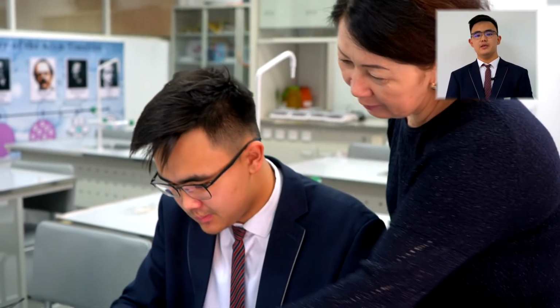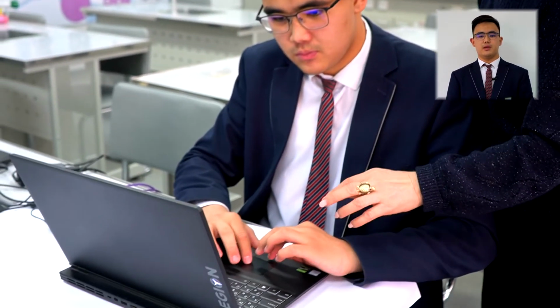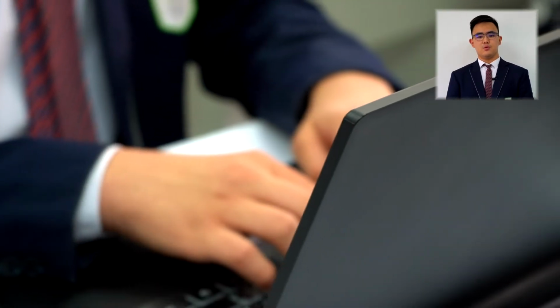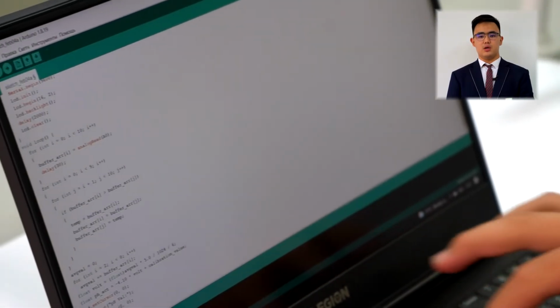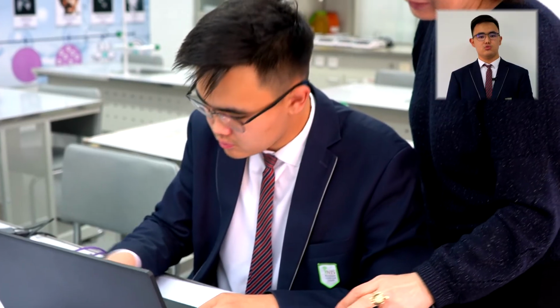Some challenges I faced are the availability of a pH meter for public use. Spark is laboratory-grade equipment and its accessibility is not common. That's why I use an Arduino pH sensor since I am passionate about robotics. The next step was to create a mobile application. For this I studied programming languages like C++ and Python. But then I decided to use MIT App Inventor because it's an easy-to-use visual programming tool.